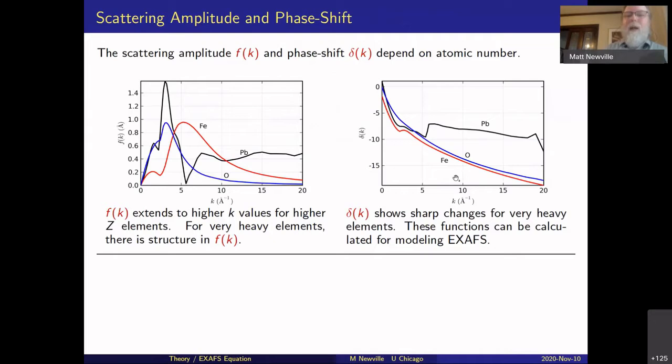If you look at this plot of delta, they're all different, but they all start at 0, and at a k of 20, they're all about minus 20. So they all have a slope of about minus 1. So if it's 2kr plus delta, and that delta is minus k, that gives a phase shift of half an angstrom. And it's all down, so it's all to lower R value. So it's 2k times the quantity R minus a half, roughly.